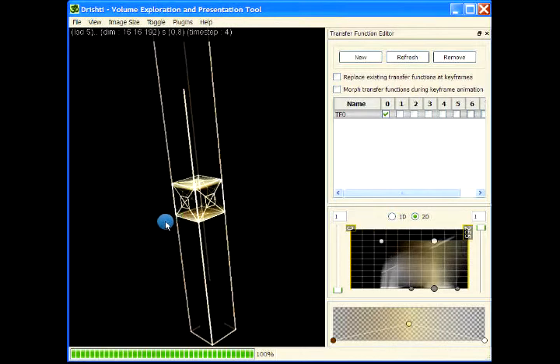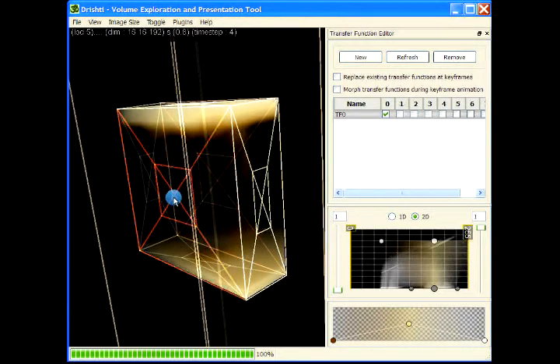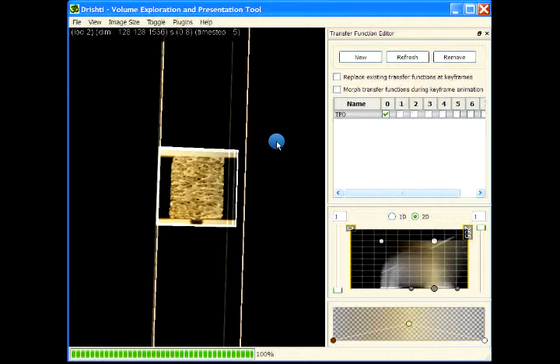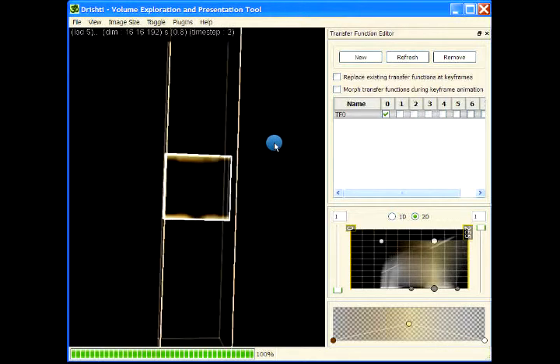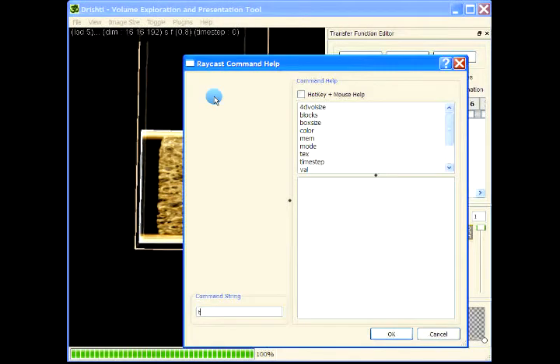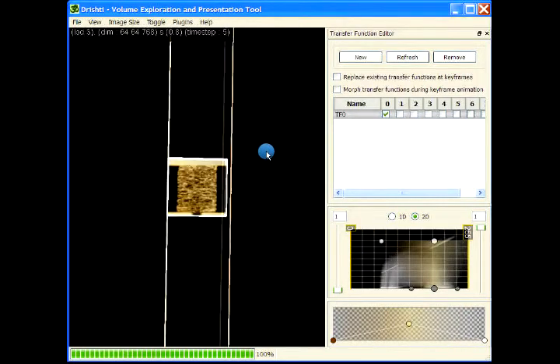Press F2, and then you can say, for example, take just a slab of that and press F2. And now again, if you press Z or Shift+Z, then that box keeps on moving. You can also use, say, spacebar and then time step. Say I want to go to the 5th time step, so it will automatically jump to the 5th time step.